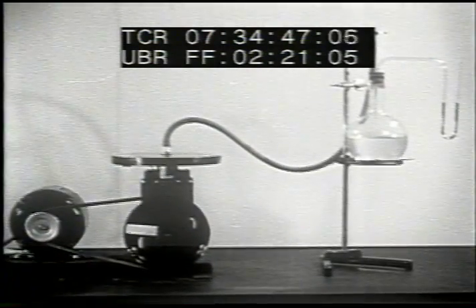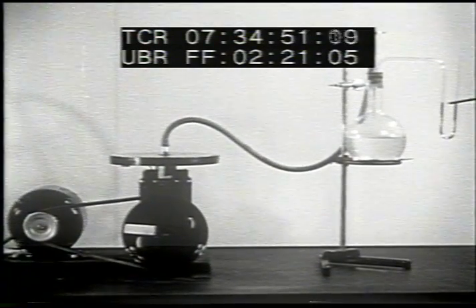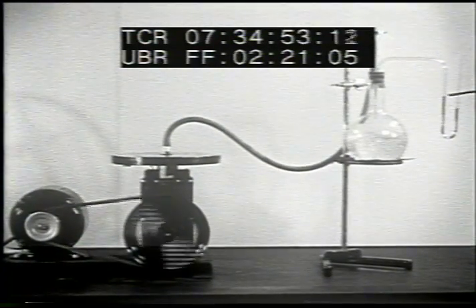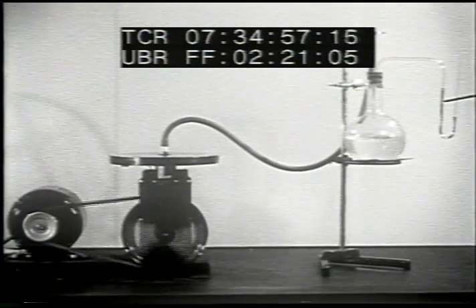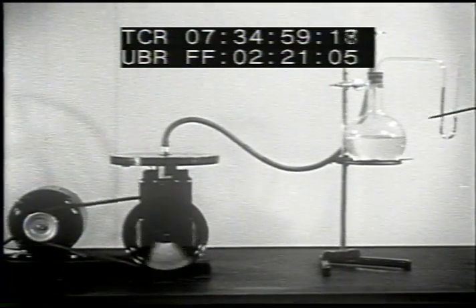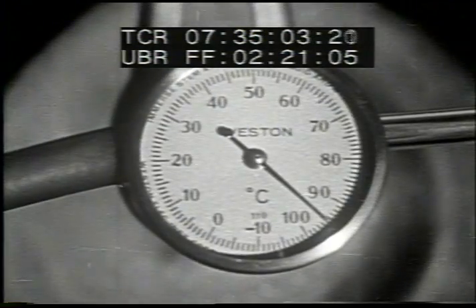We now remove the burner and allow the water to cease boiling. A vacuum pump reduces the pressure, as shown by the U-tube. Once again, the water boils, this time at a temperature lower than the original boiling point. Lessening the pressure always lowers the boiling point of a liquid.